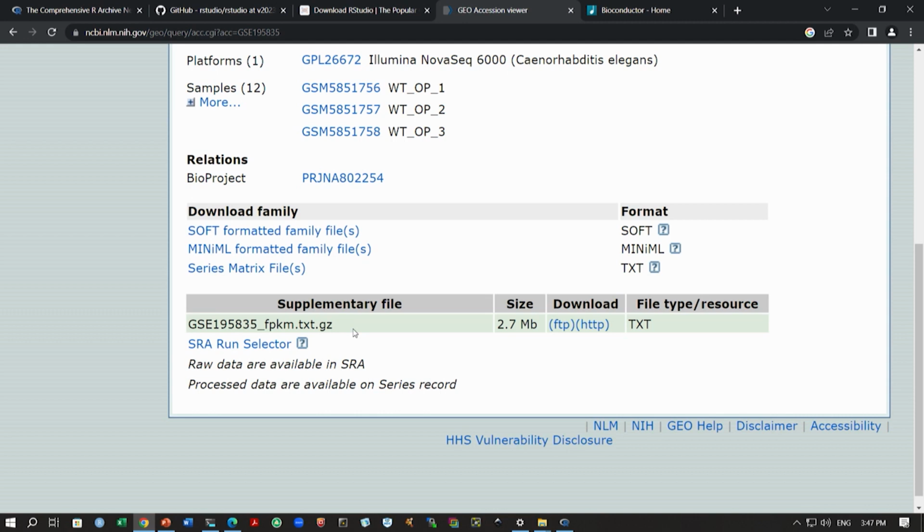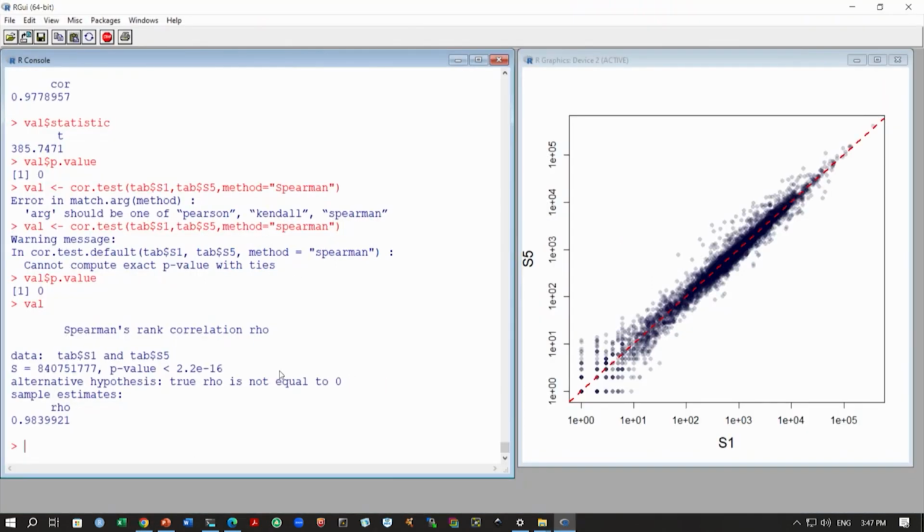Now, we can actually go back to R again, and we can see how we can install some of these packages. Okay. All right. So, this is all fine. Now, we want to use some packages. As we have mentioned, we want to use this DESeq2 package, and for plotting or for different types of tests, we want to install certain packages.